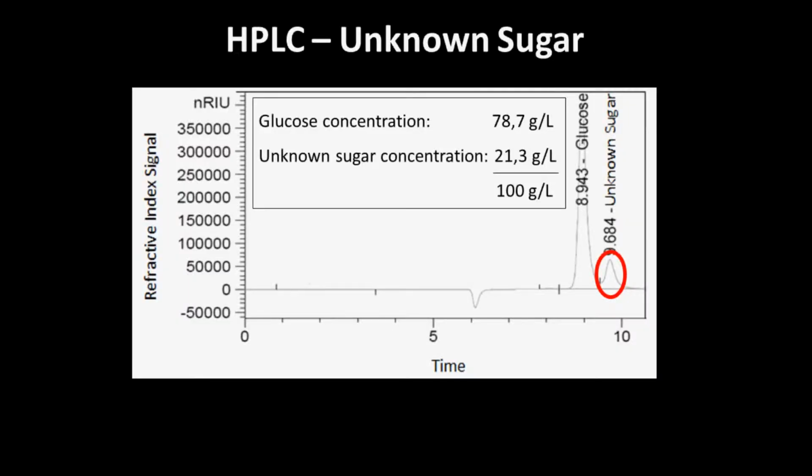The HPLC analysis of this differently done experiment is quite interesting. You can see it on this image. There is clearly some formation of an unknown sugar during autoclaving.